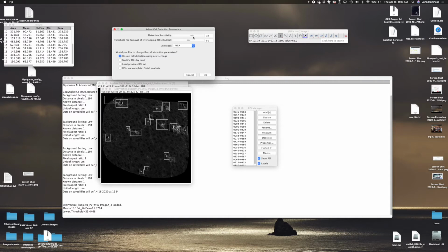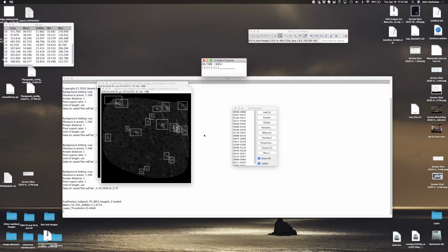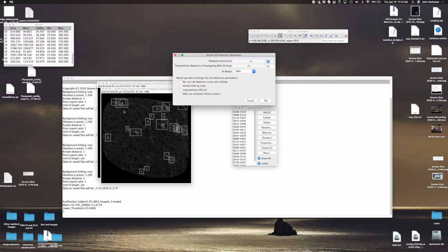Alternatively, we can go extremely high, and what you'll see is the AI start to enter the matrix. So let's go a little high. Let's go 30. So yeah, it still did a pretty good job.